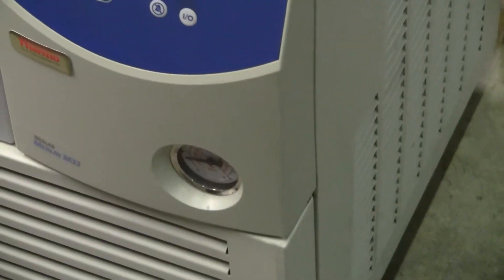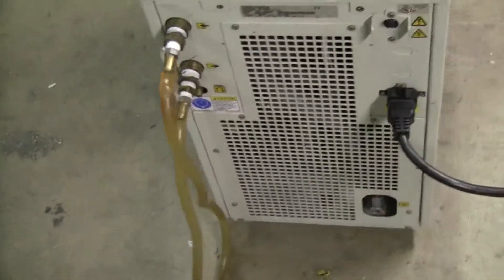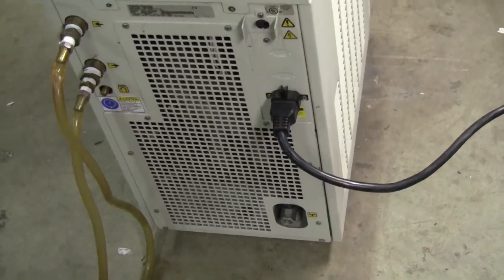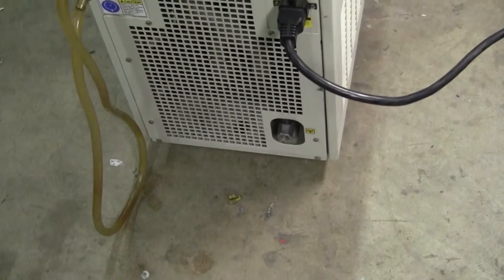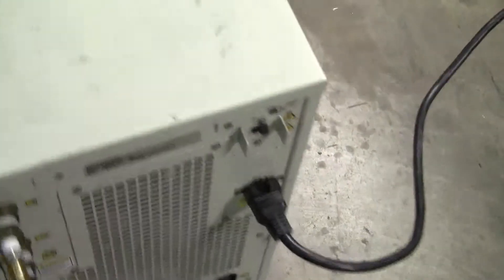Set points at 5 degrees. Pump's fine. Unit seems to be in good working order. In and out — it's 115 volts. There's a drain down the bottom. Fuse in the back. Other side. Looks good.